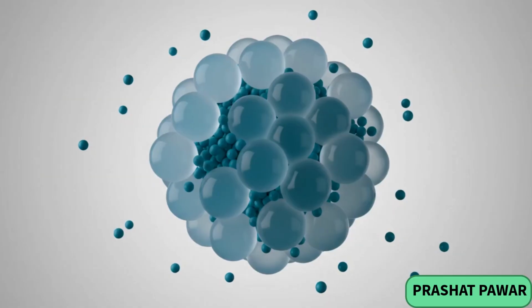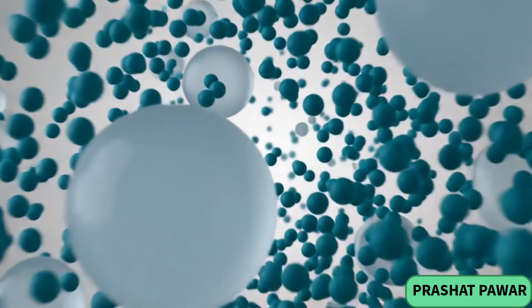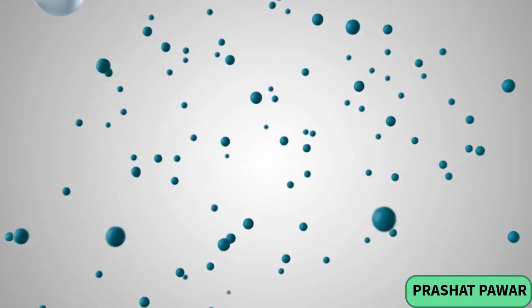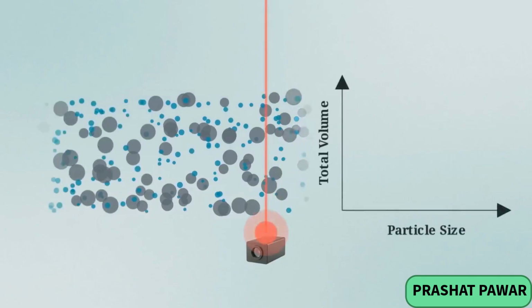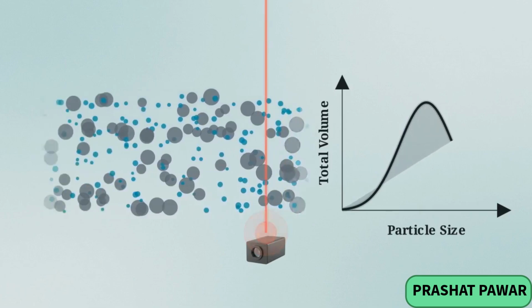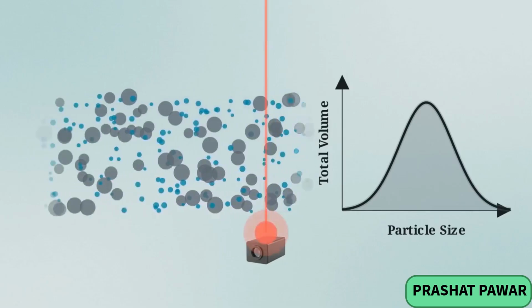The resulting aerosol cloud is highly chaotic. It is a dense, fast-moving mixture containing both the active pharmaceutical ingredient and the inactive carrier formulation. Standard analytical tools, like optical or laser diffraction, measure this entire cloud indiscriminately. They capture the size of everything passing through the beam.